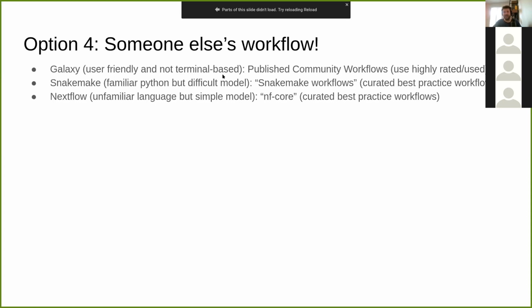And then finally, there's Nextflow, which I use quite heavily these days, which is a little bit of a more unfamiliar language. The code you have to write is a little bit different, but it has a simpler model where it works from your inputs to your output rather than backwards. And the nice thing is they have this group of nf-core workflows, which are best practice workflows that other people have written, like a crowdsourced commitment.